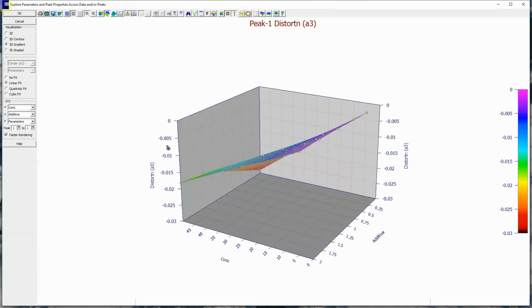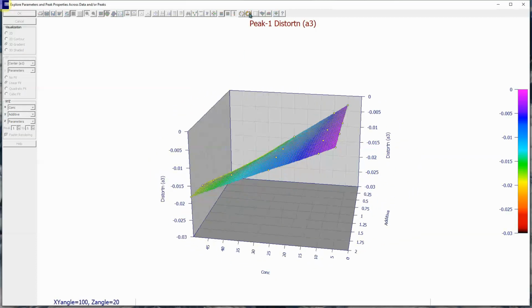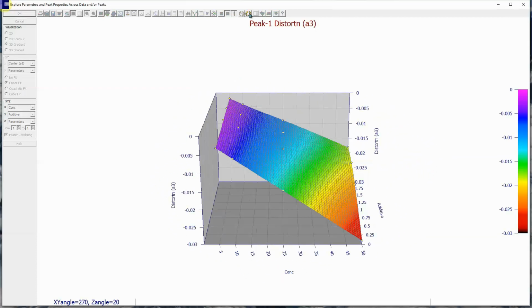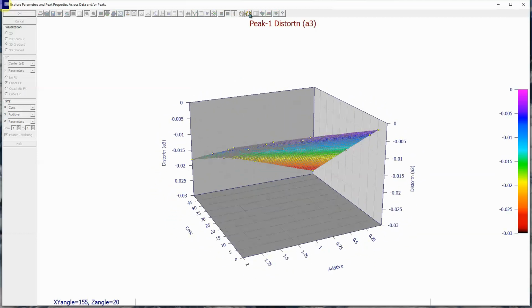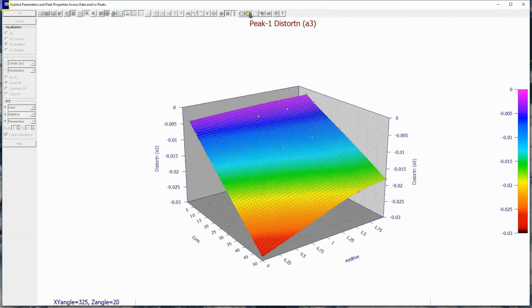We're now looking at the A3 chromatographic distortion. This is the tailing and the fronting that are estimated in the HVL and NLC models and their generalized extensions. This is an astonishing efficacy of modeling here. This chromatographic distortion, despite describing a higher moment skewness, is about as perfect a surface as one could hope to see with real-world chromatographic data.